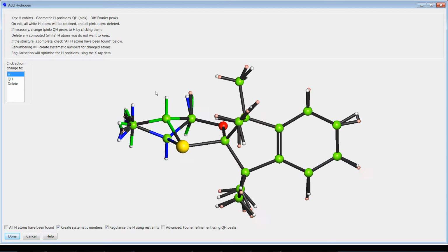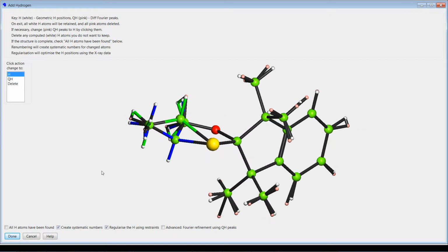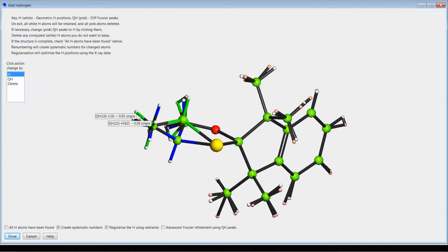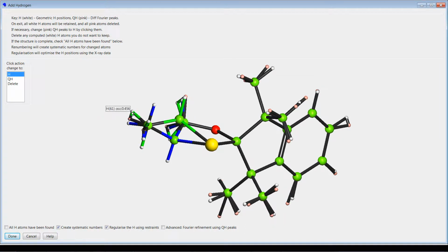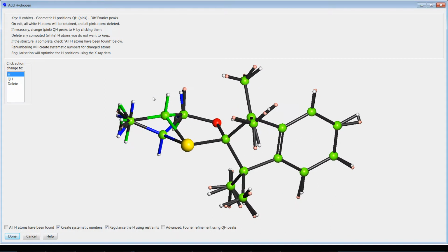It's the neighbouring atoms where it gets a bit more complicated, so this vector into this carbon here is different depending on which of the two conformations you're in, and therefore the distribution of hydrogens on this sp3 carbon, this methyl at the end, are going to be different as well, and so they also end up in different parts with different occupancies. But all of these things are linked together. There's only one parameter being refined which defines the occupancy of the whole thing.